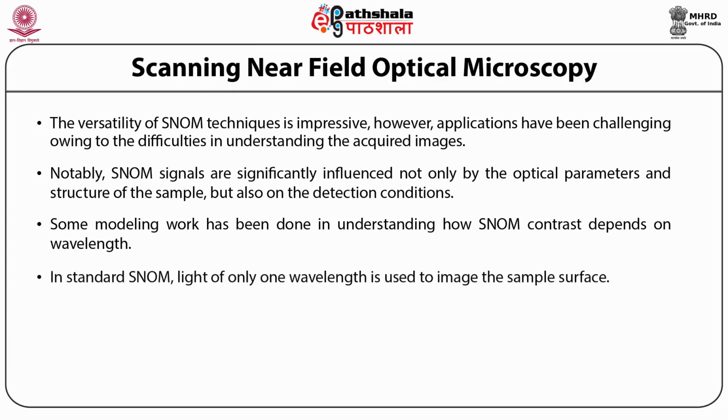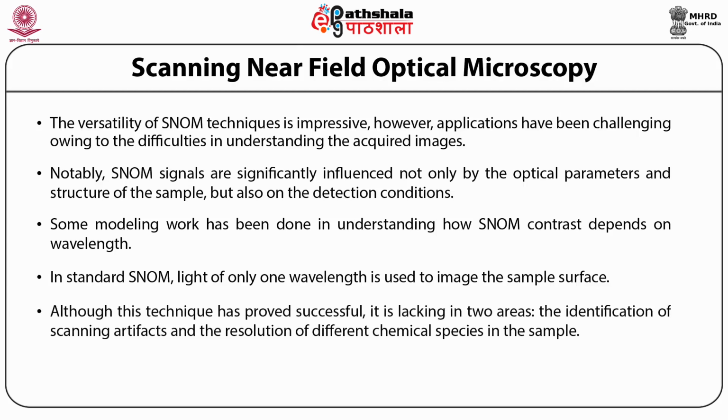In standard SNOM, light of only one wavelength is used to image the sample surface. Although this technique has proved successful, it is lacking in two areas. First, the identification of scanning artifacts, and secondly, the resolution of different chemical species in the sample.